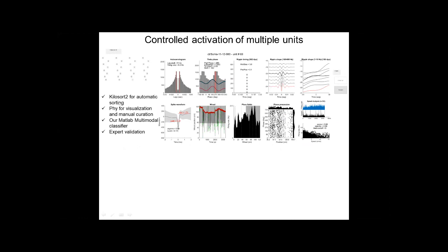automatic sorting of all the 8 channels per shank, followed by manual correction for visualization. And then, so we know exactly the location of the cell within the shank. We look at the spike waveform of the cell and look at the firing dynamics of this cell, the spontaneous dynamics, by using the autocorrelograms. Those are criteria that you can then use, combined with sorting, to separate pyramidal cells from putative interneurons.